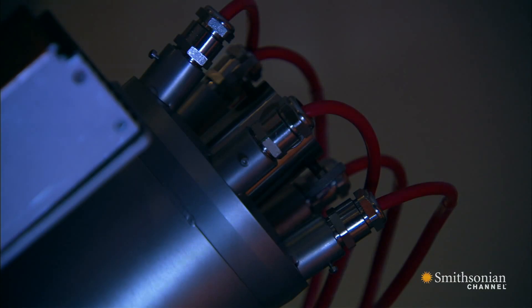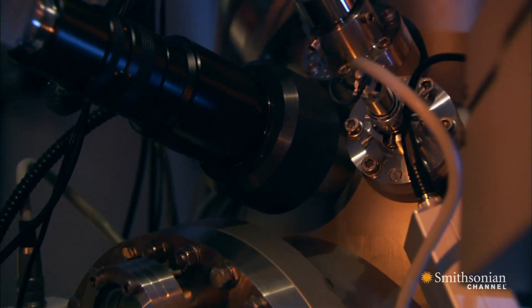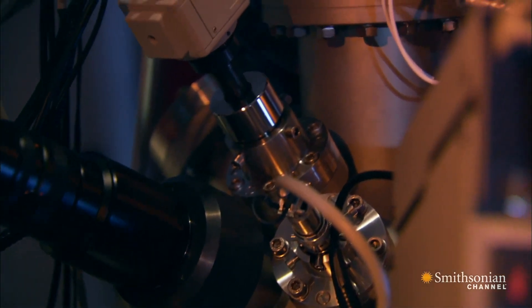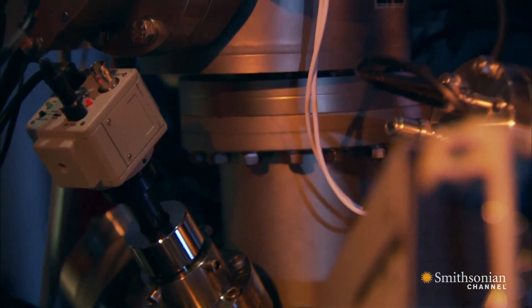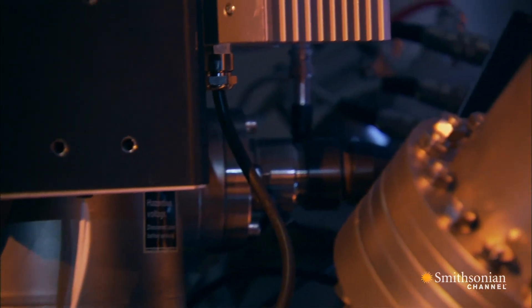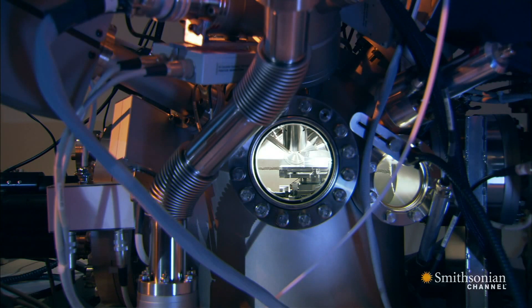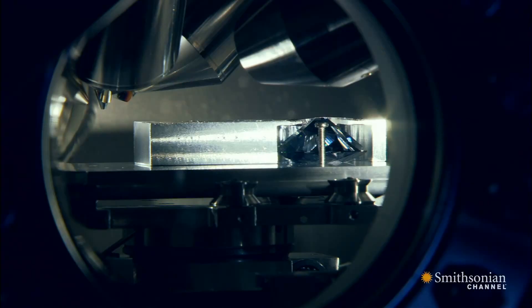They're using a time-of-flight secondary ion mass spectrometer — an instrument more often used to test chemical substances, for example, for traces of steroids. They're about to open a window into a world more than a billion years old, when the diamond was created.